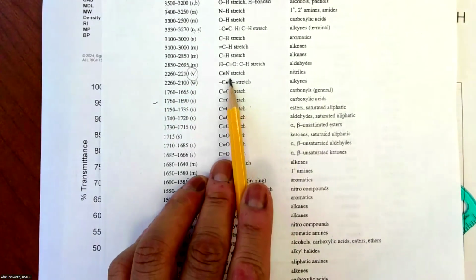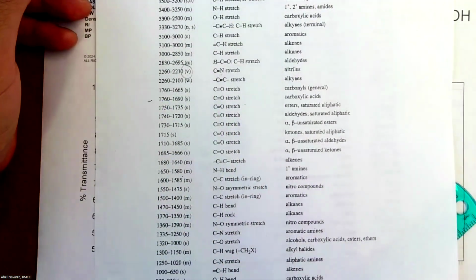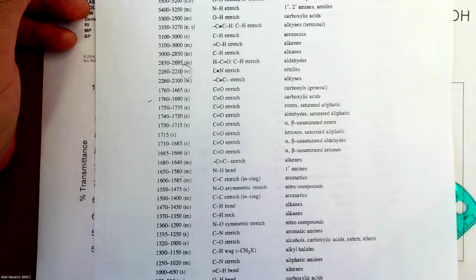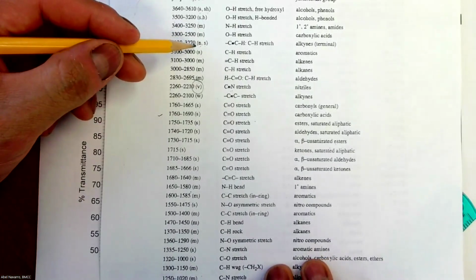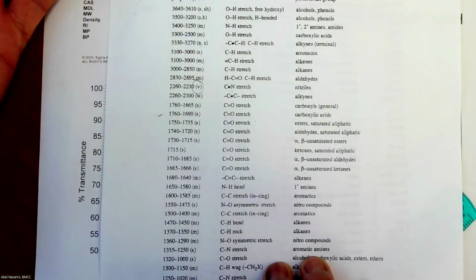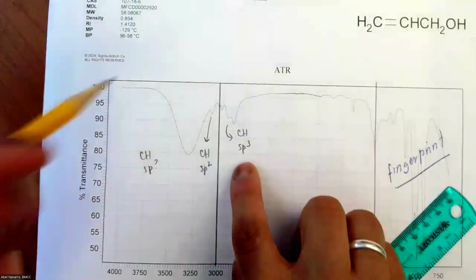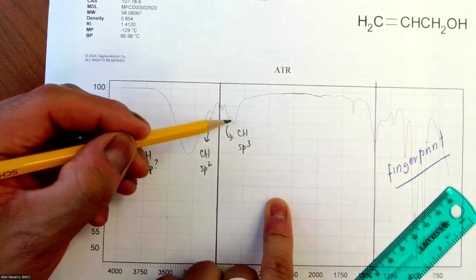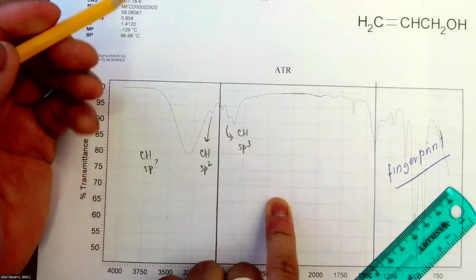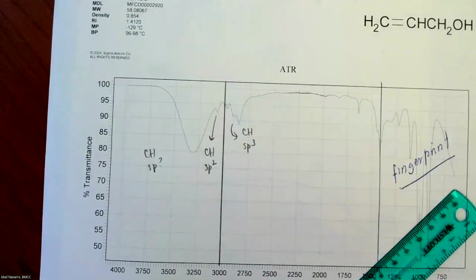The C triple bond N is variable, so it can have different intensities, heights, and also widths for those peaks. That's how you will know if a peak is expected to be narrow, broad, or sharp. Now you say, Professor, but here I see many peaks. Is there any way I can differentiate between those peaks? How do you know if it is this one or this one? It's a group. So for CHs, it's a group.